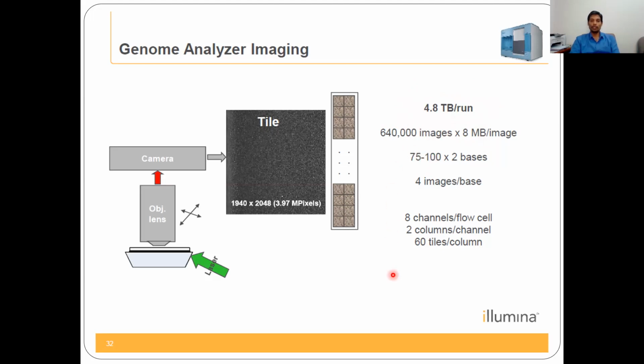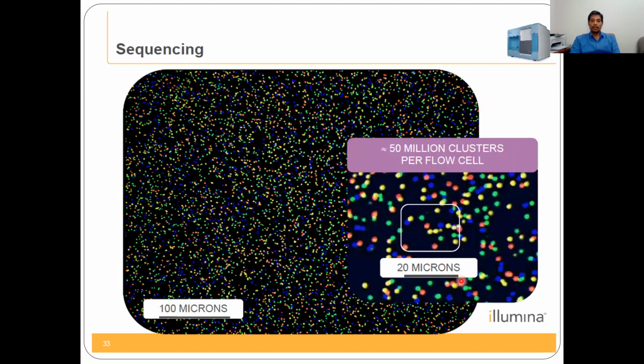But of course, to the naked eye, it is not clear. But when you go to 100 microns zoom, this is how it looks. See, within each cluster, a few hundreds of sequences are there, but all hundreds of the sequences will take a particular kind of nucleotide.